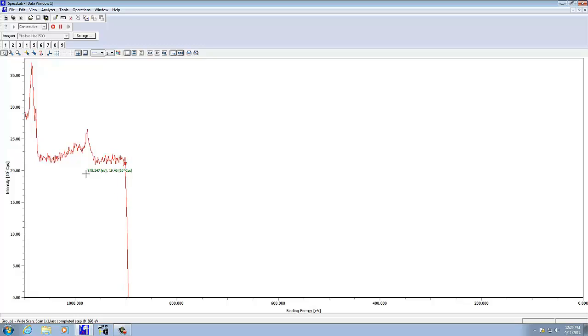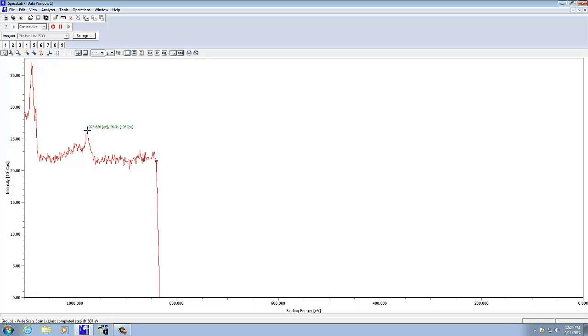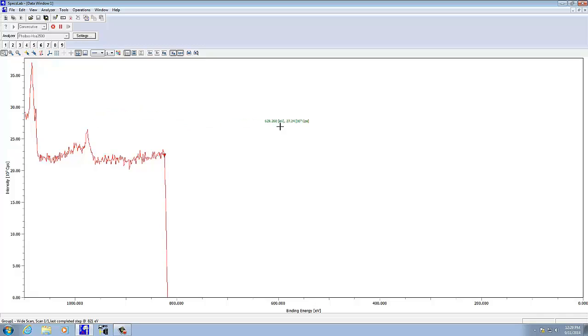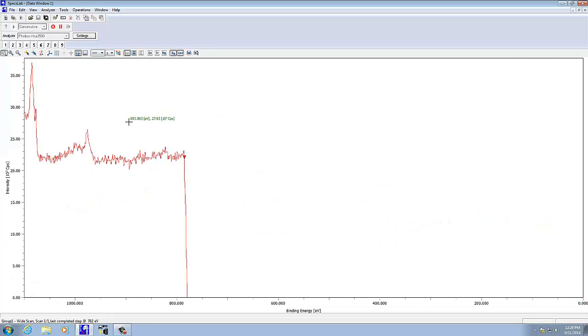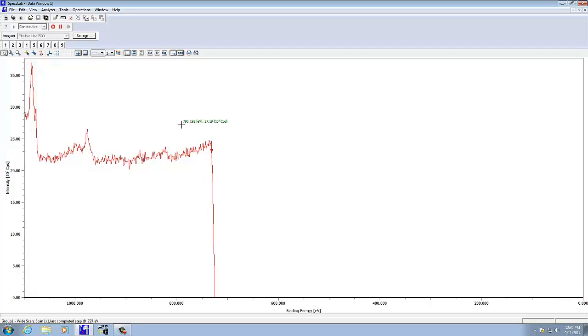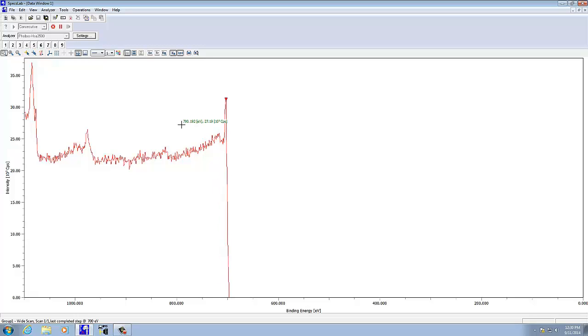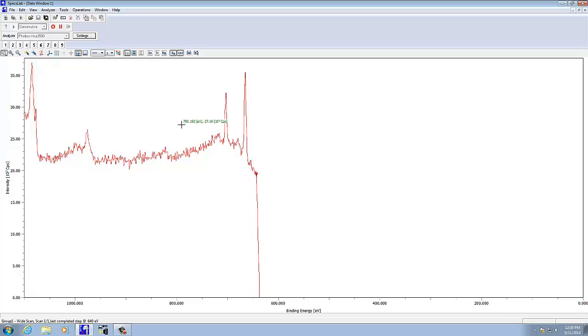As the scan goes through, I can point out a couple other things. If you're wondering what energy a certain peak is at, as you move the cursor, it automatically reads both the binding energy and also the counts per second, so you can read that pretty easily. You can always zoom in on an area. If I just box this in, I zoom in on that. If I want to go back, I just double-click, and it'll go back to the wide scan.